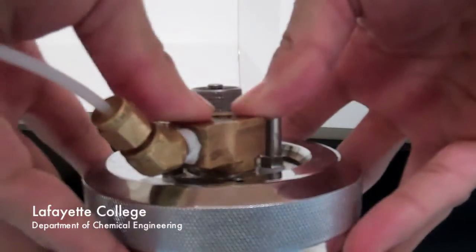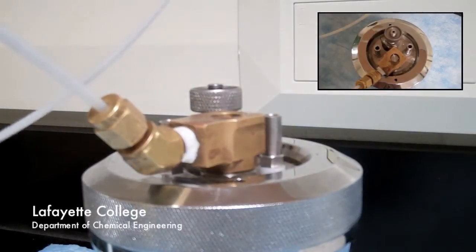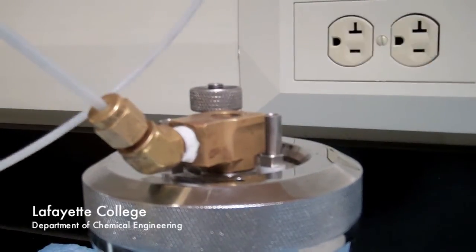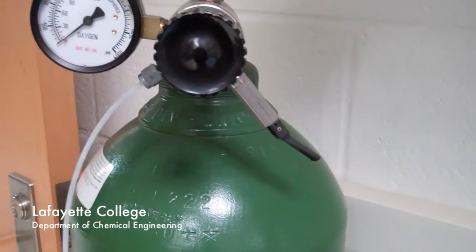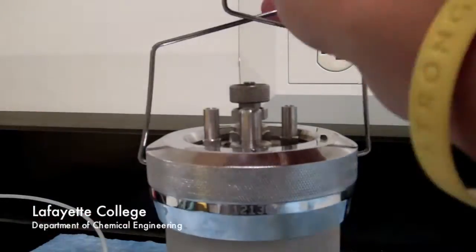It is very important the pressure does not exceed 40 atm. If it does, depressurize the bomb with the gas release valve and start over. Once the bomb has been pressurized, release residual oxygen in the hose by opening the valve attached to the hose.